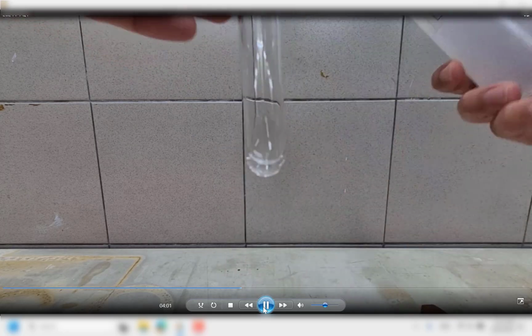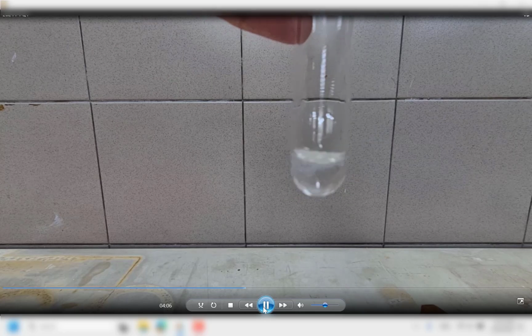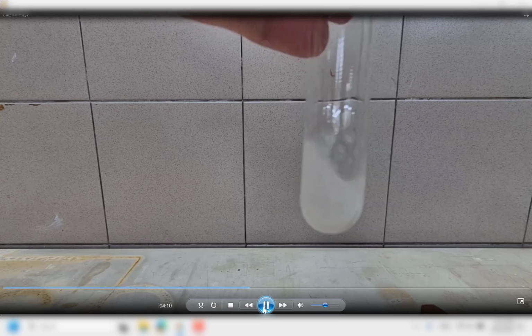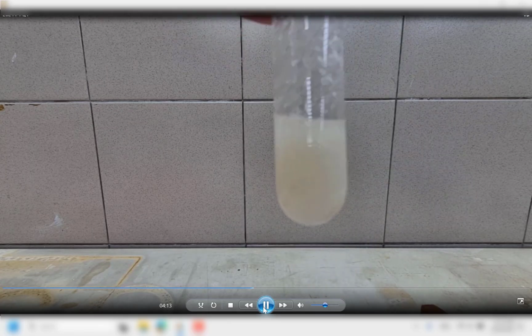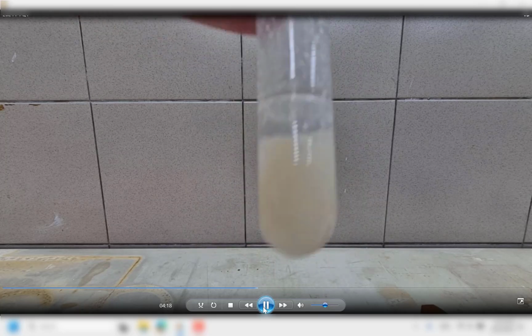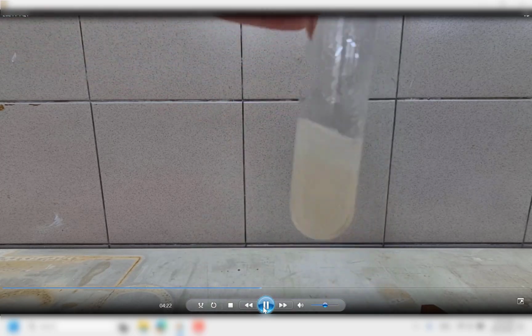Right now I'm going to skip to test number 3. This is the aqueous ammonia one. I add in FA1, and if you notice, you get white PPT, and then after a while, you swirl the test tubes, and then you get brown PPT or white PPT turned brown. It's a mixture. Take note of the wall of the container.